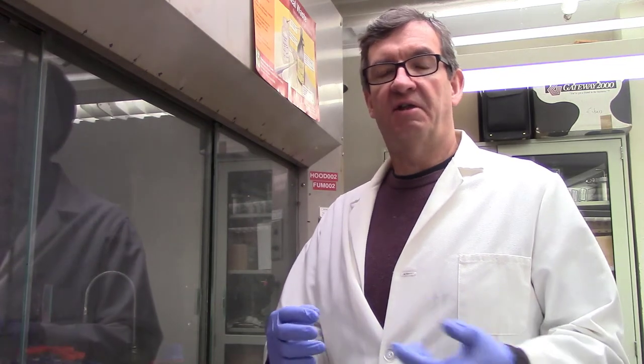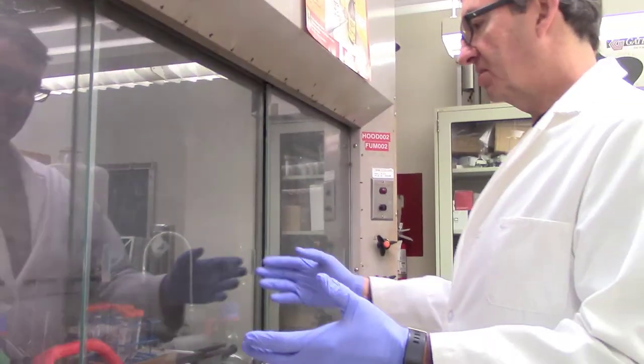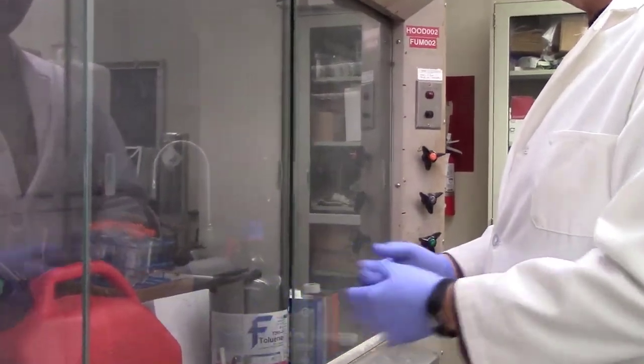Well, in our laboratory we have a number of hazardous materials that we work with in our experiments looking at aerosols. We have some semi-volatile chemicals like oils and pesticides, and we also handle powders and then suspensions of nanomaterials, so all of these can be inhalation hazards and even dermal hazards. Many of these hazardous agents we store and work with in laboratory hoods like this one, and this laboratory hood is at this point very crowded, it's overcrowded and there's really no workspace in this hood and it should not be this way. We have a gasoline can that has some gas in it.